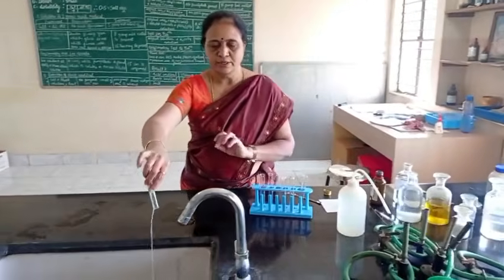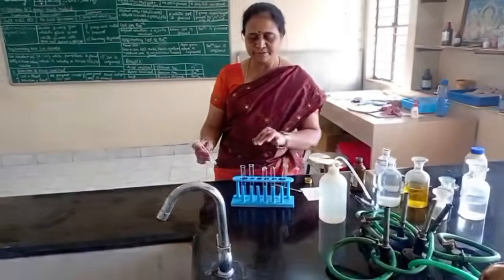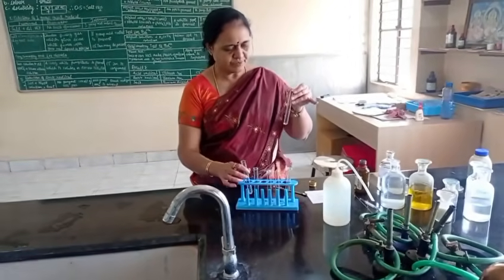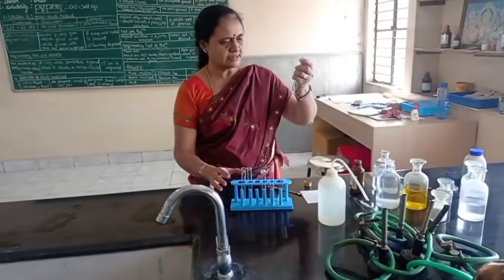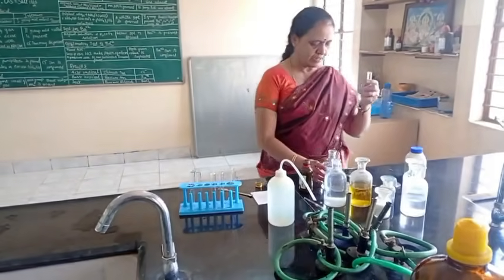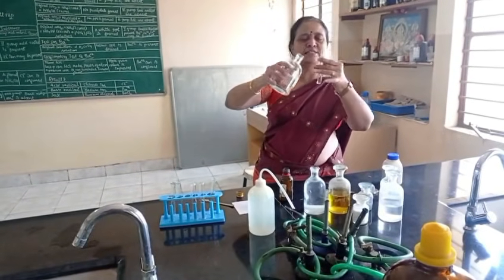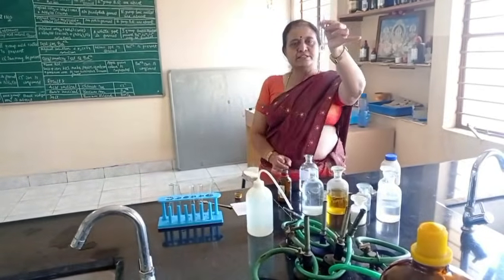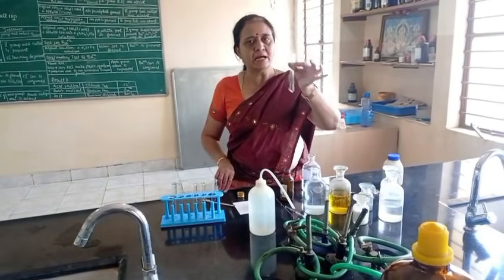Now, I move to detection of first group basic radical. For first group basic radical, I take original solution plus dilute HCl. See here, no precipitate. First group basic radical absent.